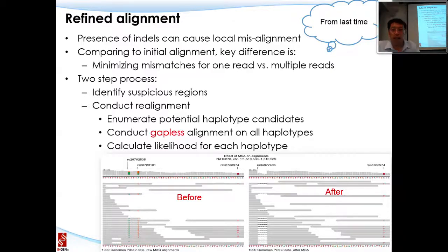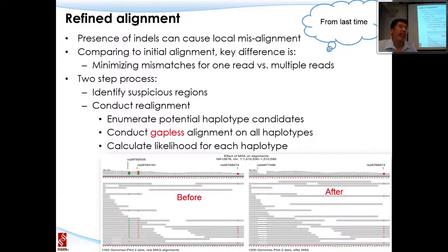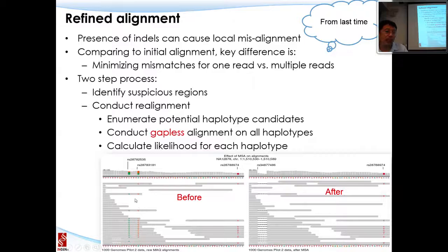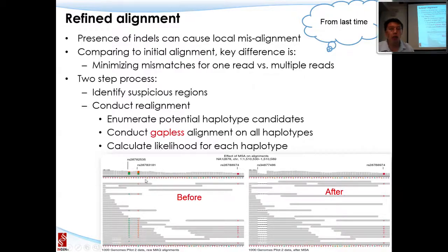To perform refined alignment, there are three steps: first, enumerate all potential haplotype candidates; second, perform gapless phase alignment on all haplotypes; and third, calculate the likelihood of each haplotype. When a novel haplotype increases the overall likelihood, it is selected. In one example, before refined alignment two reads showed apparent SNPs, but after refinement these were revealed as misalignment artifacts—false positives.